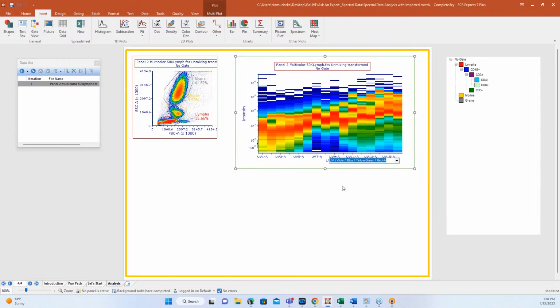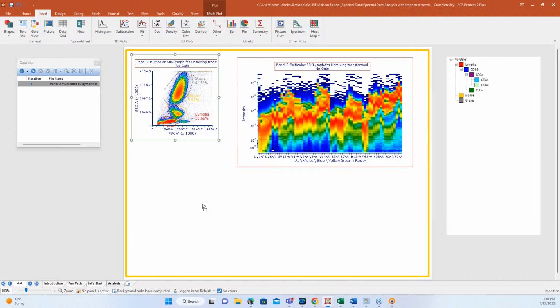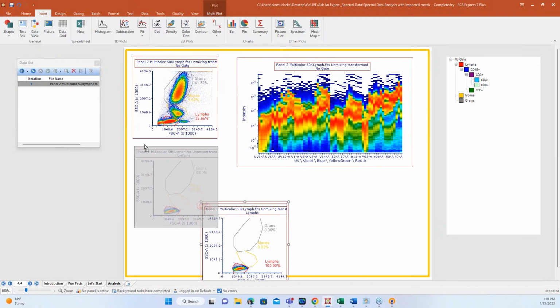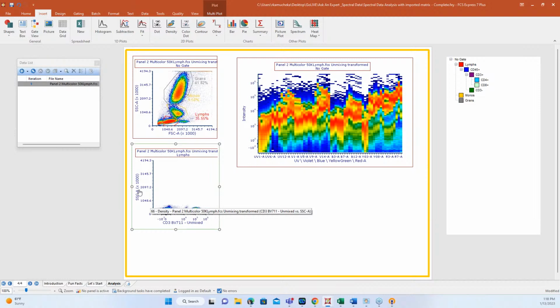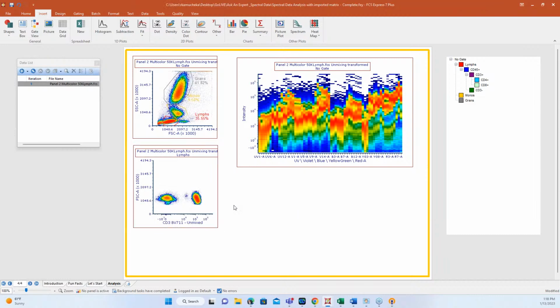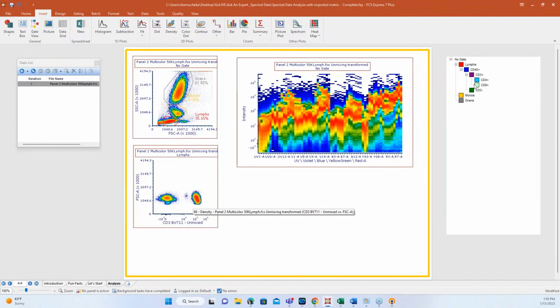Holly, what is your favorite part of spectral analysis? I know this is a loaded question, so you'll have to forgive me. Honestly, and you might laugh when I say this, it really is the visual part of these spectral plots. Same. Because I am such a visual person, and I feel like most people who do flow cytometry and truly love it are probably visual people and enjoy the actual pretty pictures. And I just feel like FCS Express does a great job visually with all of the things. And you can gate on different populations using standard plots or color plots or density plots, the same way you would on a spectral plot.